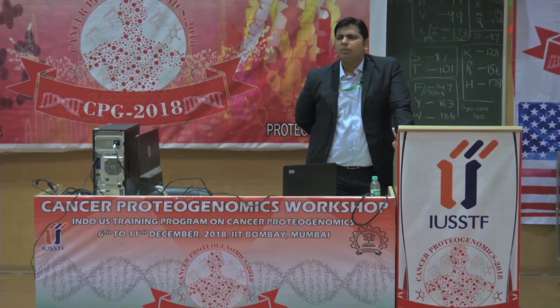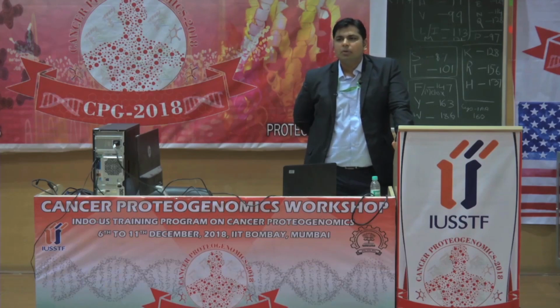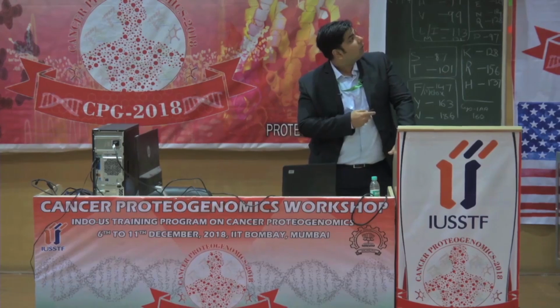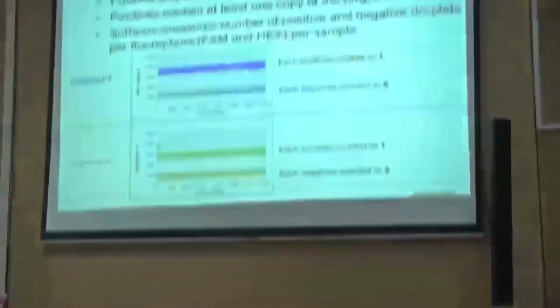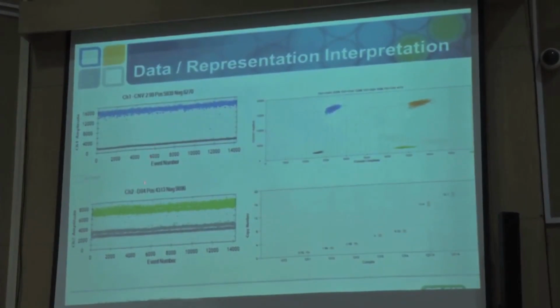It will go in either of the droplets. It can be 1 droplet, it can be 10, it can be 100, it can be 1000, it doesn't matter, because it reads each of them individually. So, what you see here, even if you have 1 droplet positive and everything else negative, you can be sure that that 1 droplet is positive because there is some DNA which has gone there and amplified, and hence there is fluorescence.